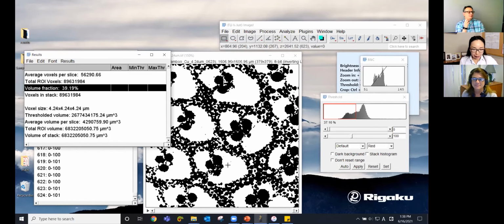So, but after the segmentation, another thing you can do is a morphology operation, meaning you can do a close, open, or dilate, erode. Those are the shape operation functions. You have a big black circle on your image, and erode means that you will do a calculation to make it smaller, or you can make it dilate. For example, if you do those two one after another, you don't change the original size, but if this guy is really, really tiny, when you erode it, it will disappear.